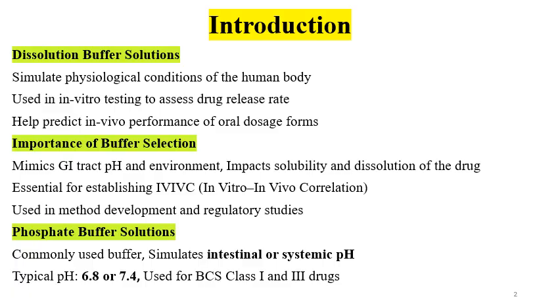The media mimics the GI pH environment. It impacts the solubility of the API, solubility of some critical excipients, and dissolution and drug release from the formulation. The media should meet the sink condition requirement. The media should be sufficient in volume to provide the sink conditions. It is essential for establishing the IVIVC, that is in vitro in vivo correlation, and the buffers are used in the method development and regulatory studies.